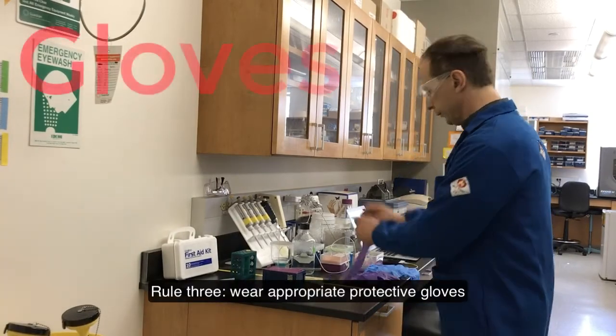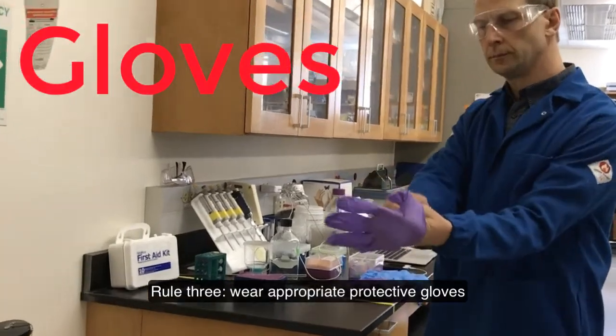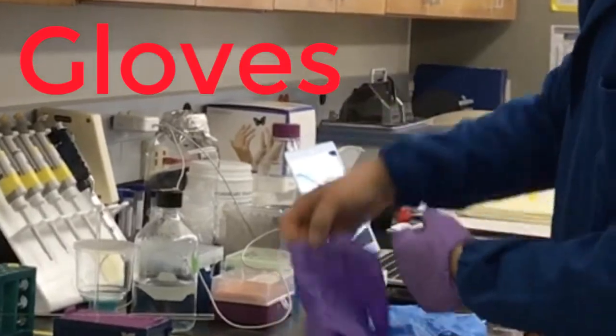Rule 3: Wear appropriate protective gloves.